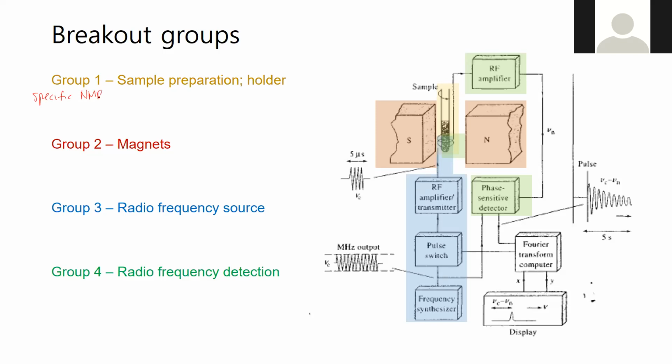You'll typically analyze either solid, liquid, or gas samples, but gas specifically is a little bit harder to do. It requires special sample tubes that you need to use in order to flow your gas in and out of the tube. Essentially, there's a lower number of molecules, which makes it hard.